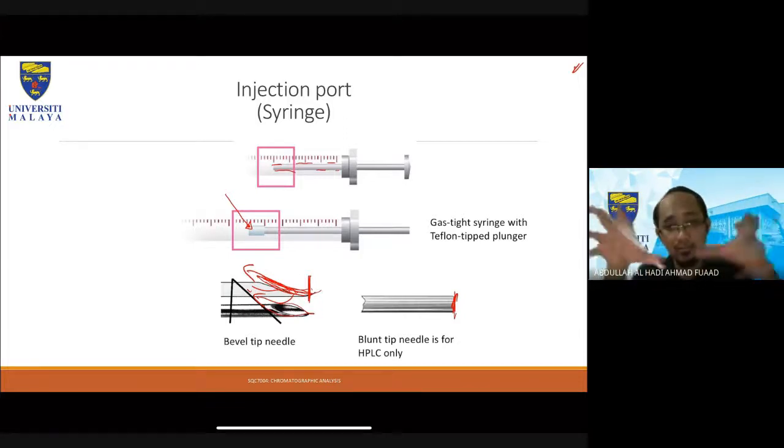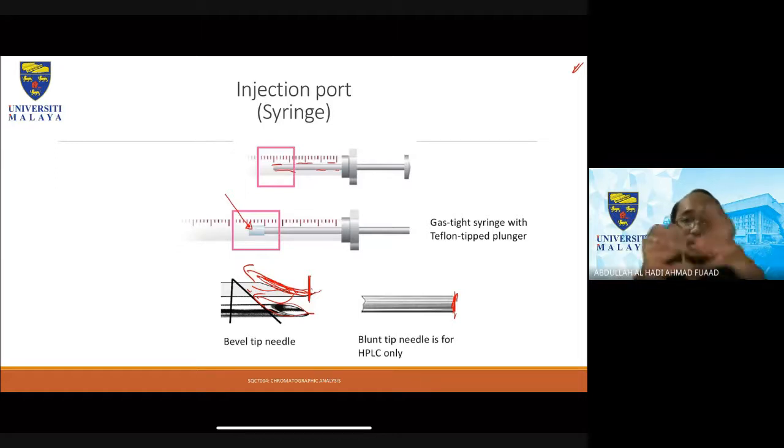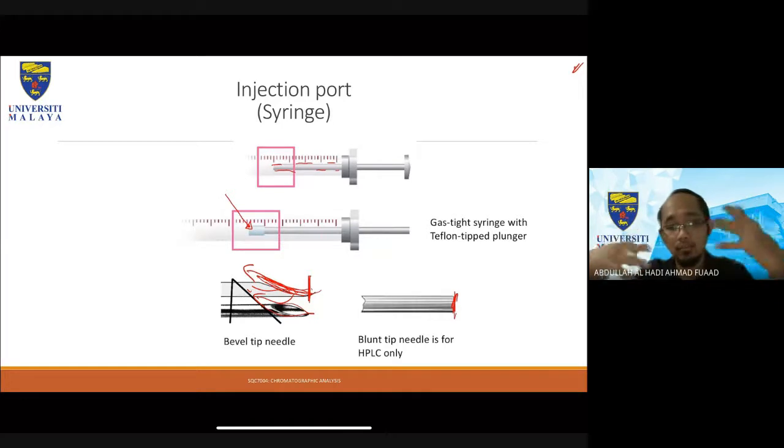Then in the afternoon, a colleague wants to do the analysis using manual injection as well. Because you have contaminated the system and the other person doesn't know, when he or she runs the system, you might get a variable reading. So it might affect your colleague, basically. So that's the general idea.